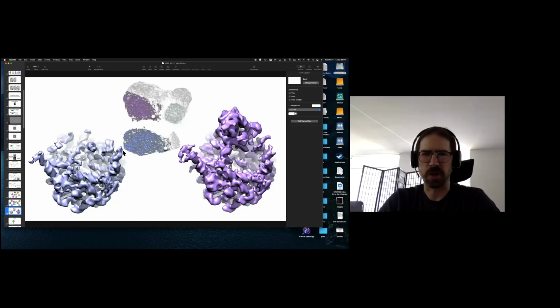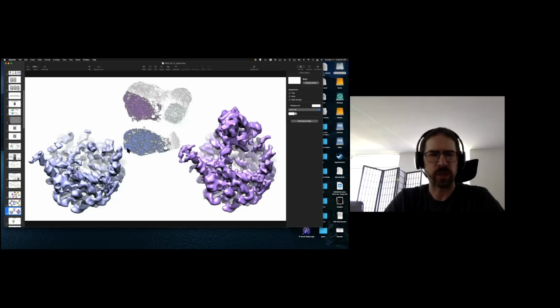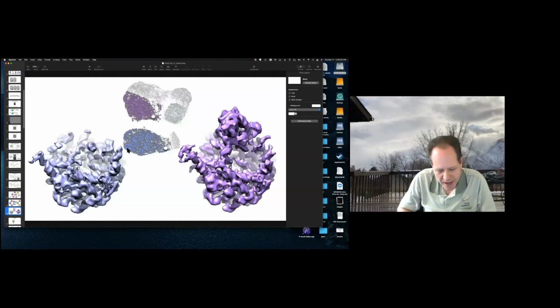Thanks. This is another follow-up question about the Gaussian mixture models, and it's very likely a naive question. It's okay. But in principle, what would be stopping things from just having one Gaussian for each atom in the protein, and assuming you had infinite compute power and you could sort out the optimization problems, just do the reconstruction that way? That's not a naive question. That's actually sort of an obvious idea to try, right?